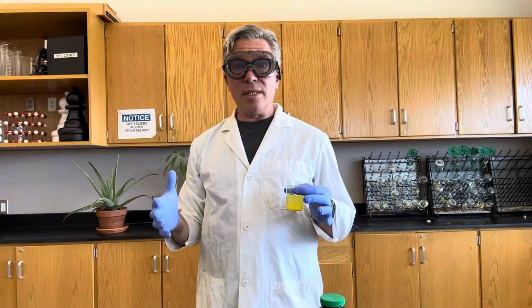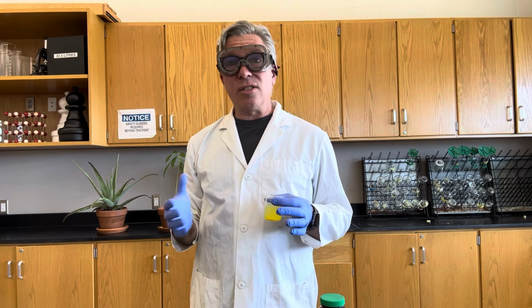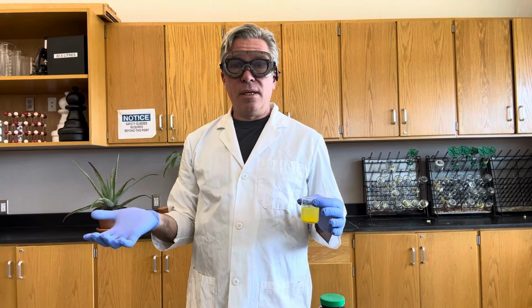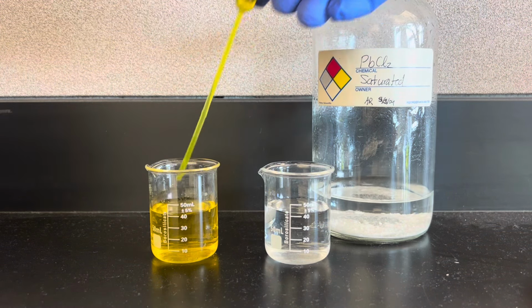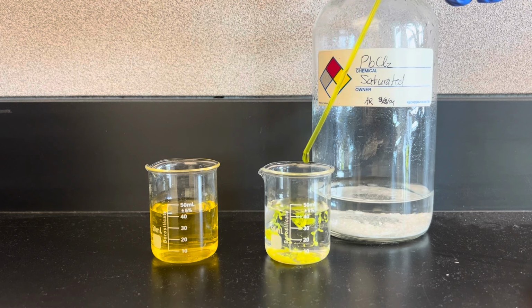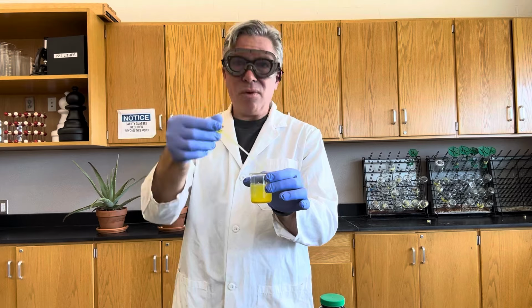And since my solubility table says that lead chloride is insoluble, that supernatant liquid should just be pure water, right? So why, when I add potassium chromate to it, am I getting this yellow precipitate? And it just kind of keeps coming. What is that?